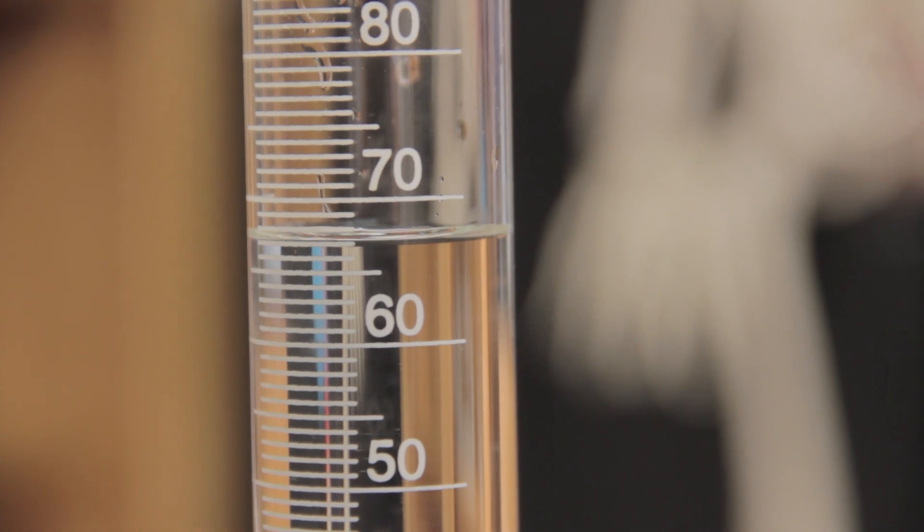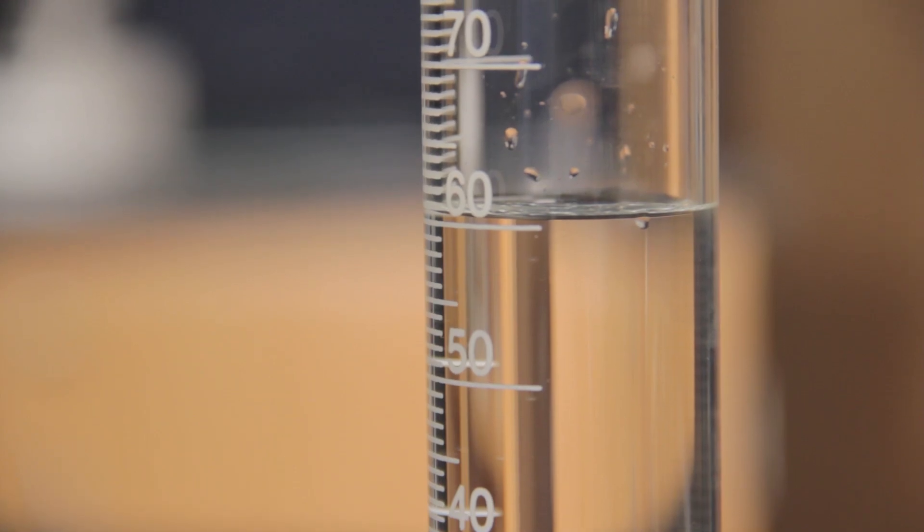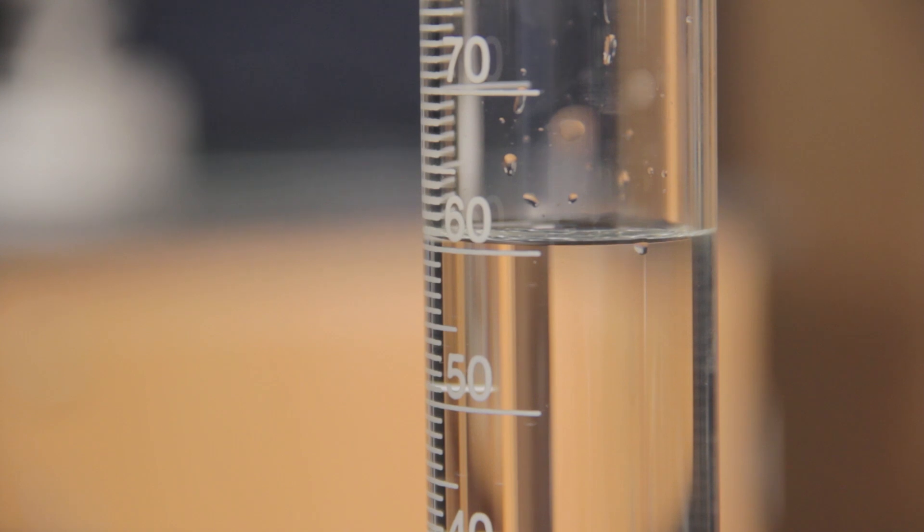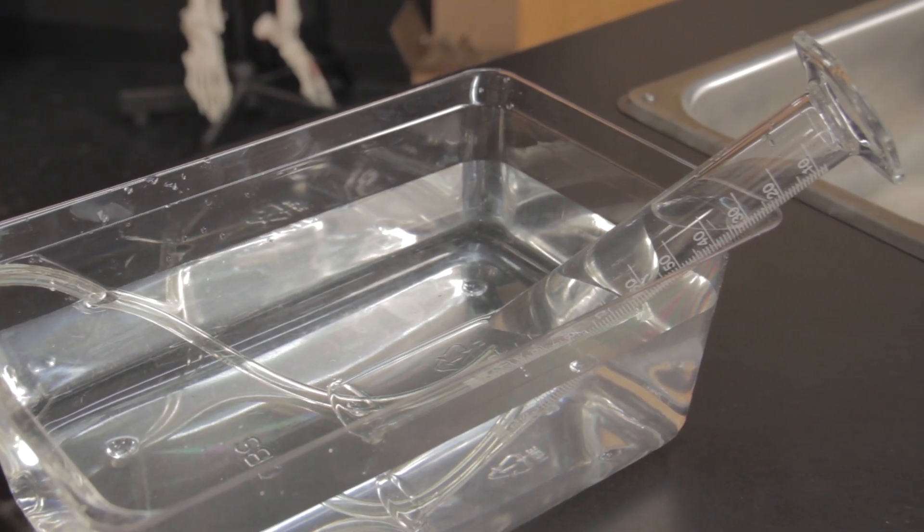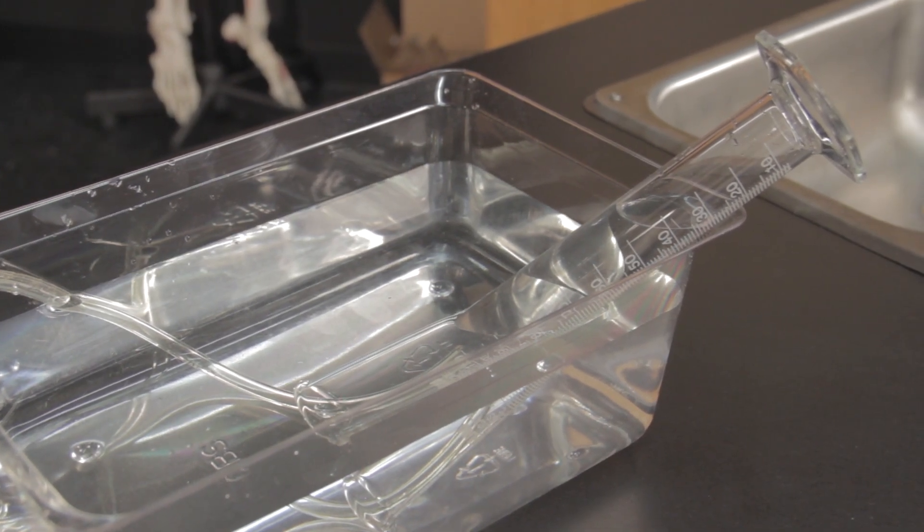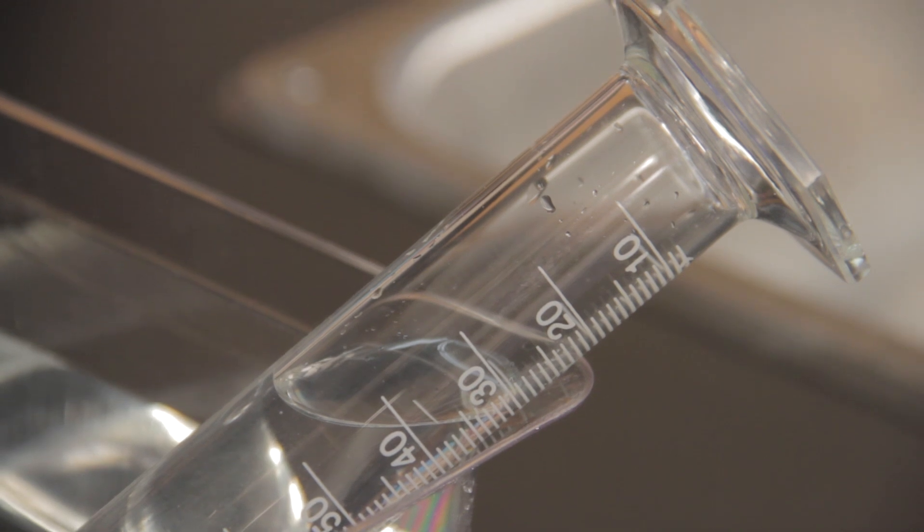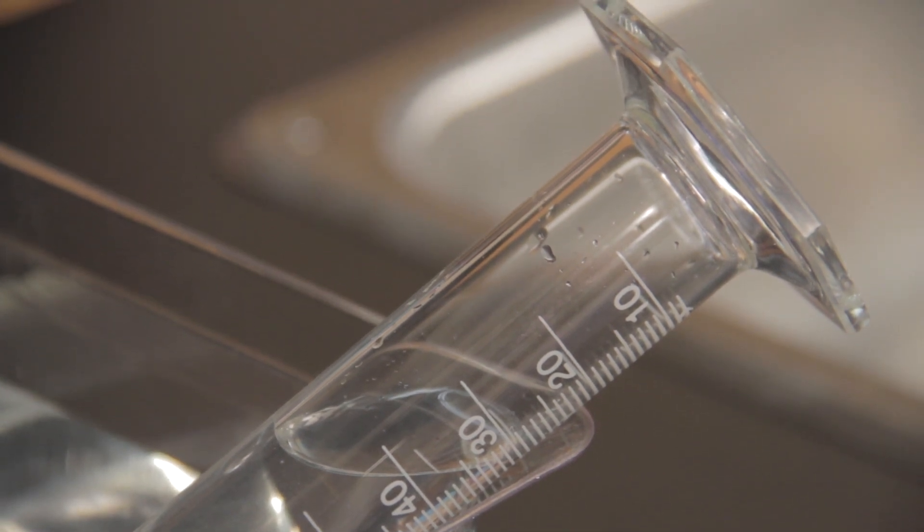In a graduated cylinder, the bottom of the meniscus, a curve that forms at the top of the liquid column, indicates the volume of the liquid. Graduated cylinders are also able to measure gases by inverting a graduated cylinder filled with water and submerging its opening in water.